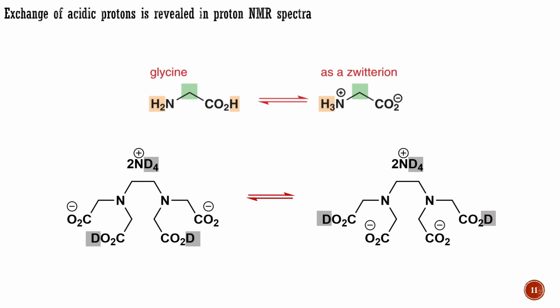You should leave this lecture with an important chemical principle firmly established in your mind. Proton exchange between heteroatoms, particularly oxygen, nitrogen, and sulfur, is a very fast process in comparison with other chemical reactions and often leads to averaged peaks in the proton NMR spectrum. I mentioned this fact before in the context of the mechanism of acid-catalyzed addition to a carbonyl group, and we will continue to explore the mechanistic consequences of fast proton transfers throughout this course.